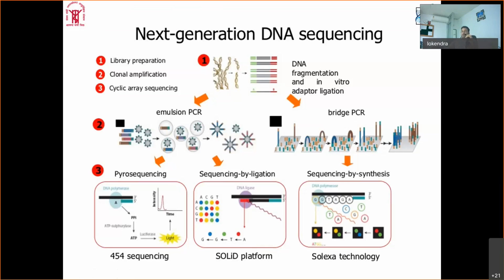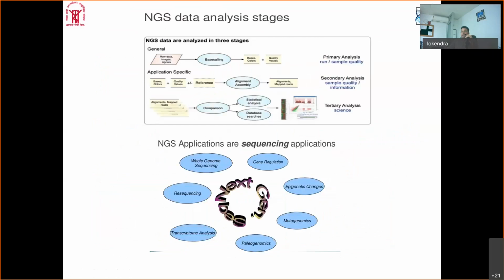So this is NGS, and again, running an NGS is not easy, because after getting data, it is always difficult to analyze, because it is a hell of a lot of data, and it depends again on what kind of sample you are dealing with, and how much reliability of data you require. Depending on the amount of data, you can determine various aspects, but overall, if we look at the NGS application, it is huge. It can be used for whole genome sequencing.